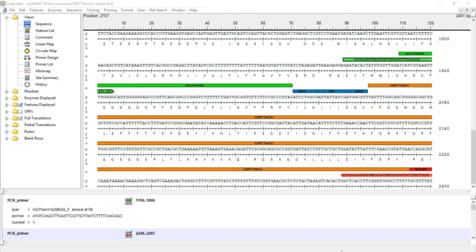Okay, so principally primer design is for PCR, and primers are just short strings of nucleotides that bind to the larger DNA that you want to amplify or modify in some way, depending on your specific purposes. These can range from mutagenesis to simply amplification. And it occurs through a polymerase chain reaction, which fundamentally follows the same pattern over and over again, and just occurs based on what you've put in there, which is DNA polymerase, nucleotides, and the primers.